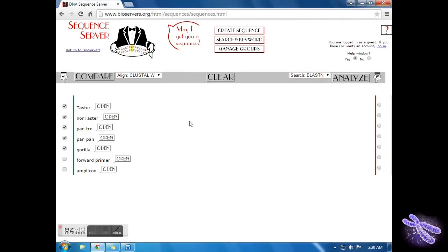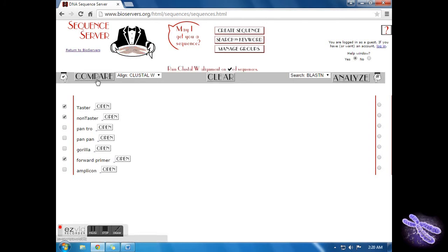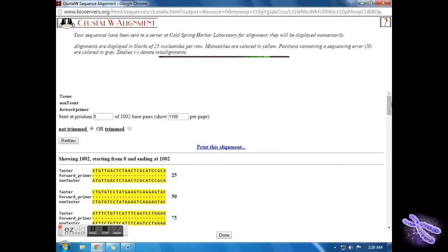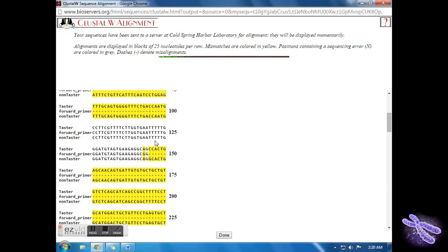Exit out of the window. Uncheck Pan troglodytes, Pan paniscus, and Gorilla. Check the forward primer and compare. Record where the primer binds. Also notice the SNP of the primer and reflect on why this is important to the experiment.